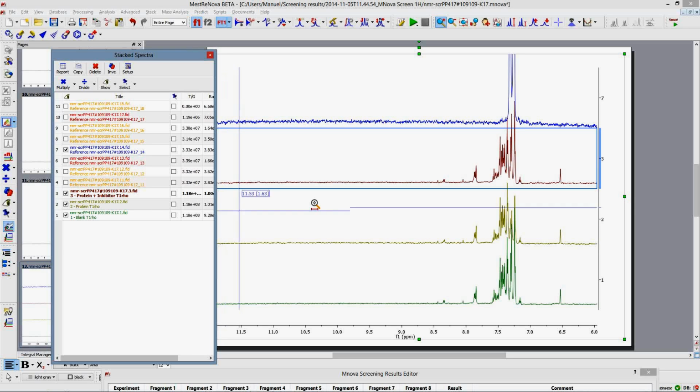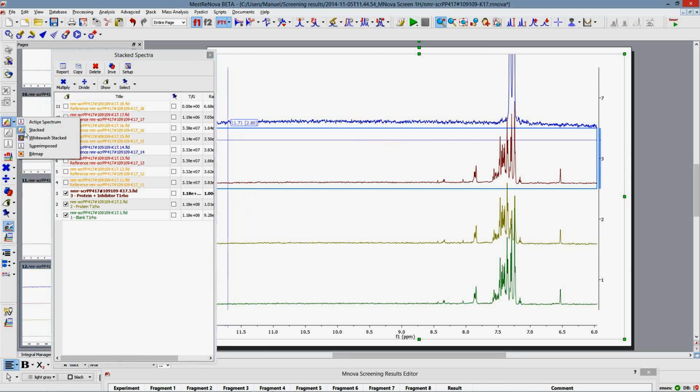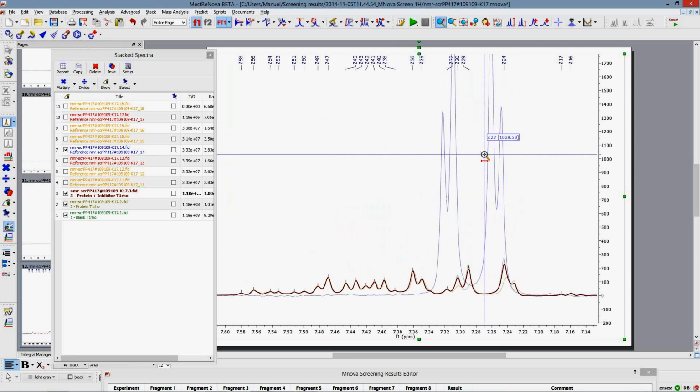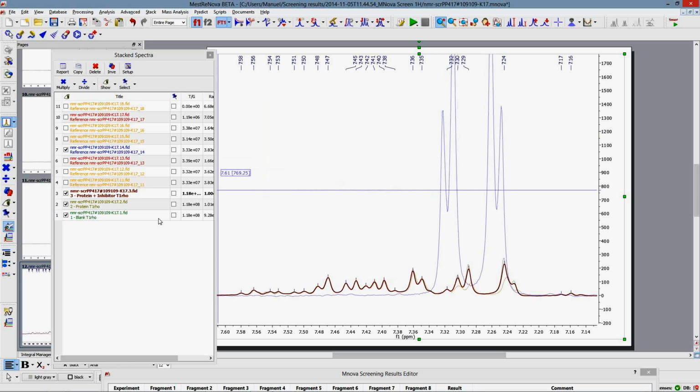But for this particular scenario, like I was saying, I use a two-combination action. It's going to be through my stack table, and the second thing that I'm going to do is superimpose my spectra. And now I can start looking at what is going on in here. You will see that even though I performed an alignment step, things sometimes, and this is experimental life, don't go according to plan, and I still have a little bit of leeway in there.